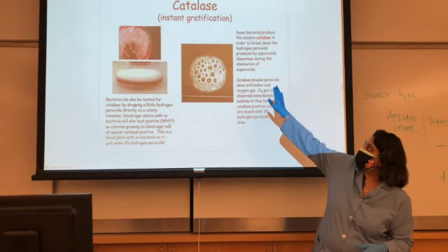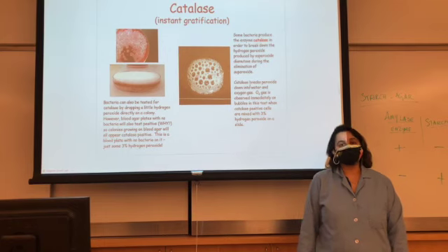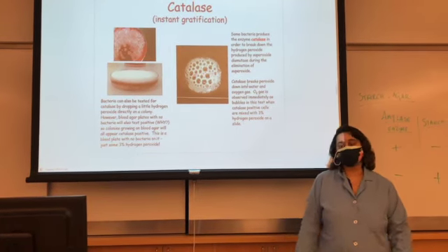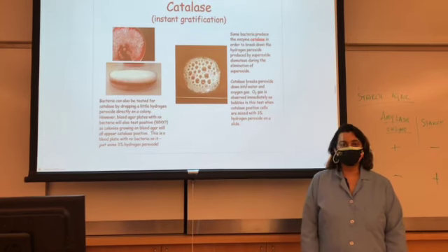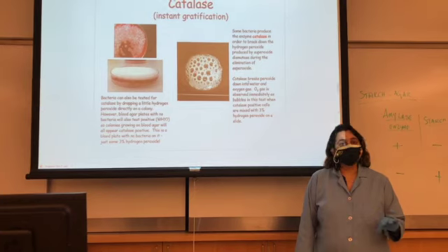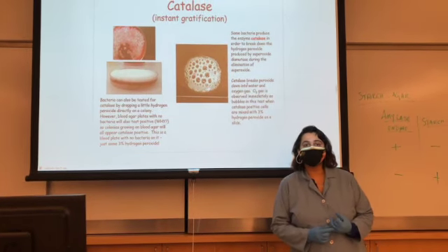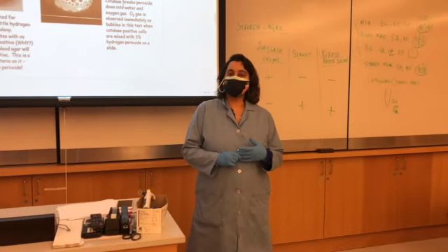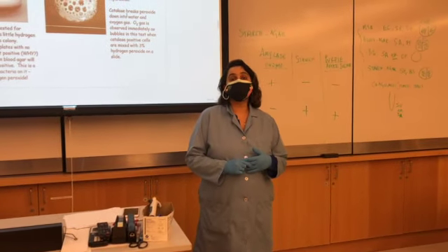This is, as you can read, instant gratification. So this is one test that you can do just right on the spot. You don't need to wait for the bacteria to grow. Okay? Alright, so we are all done with the gram-positive diagnostic test. You learned about MSA, you learned about bile esculin, you learned about blood agar, coagulase test, catalase test, and starch agar test.